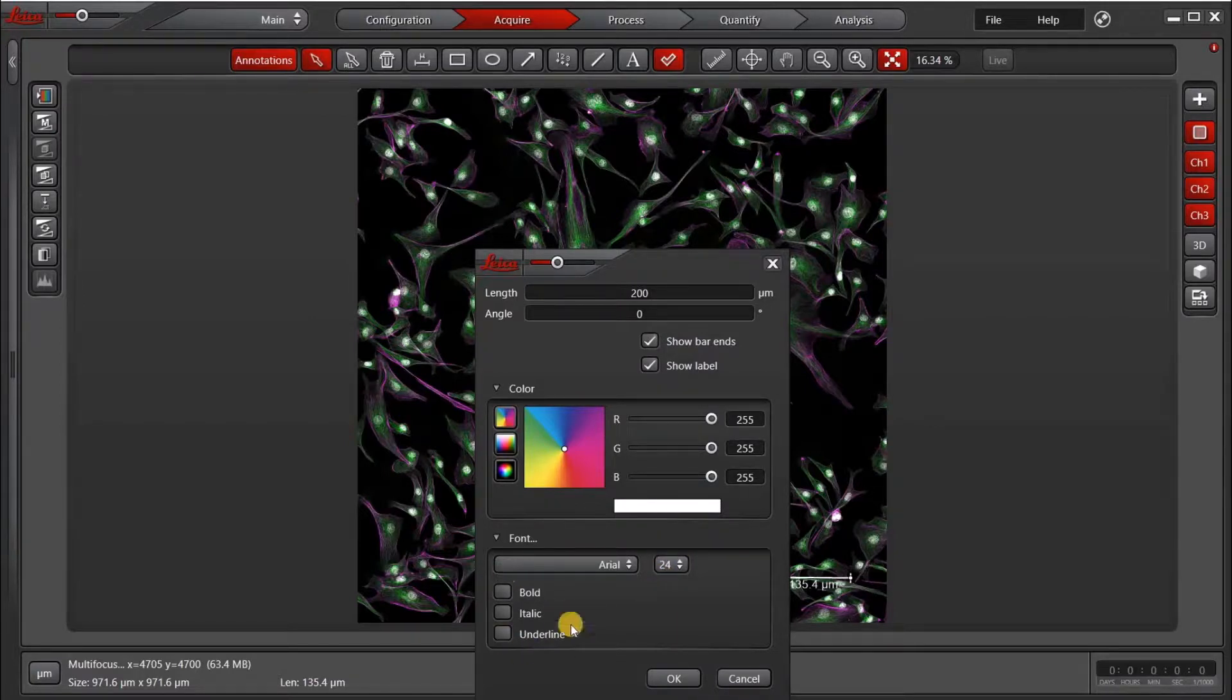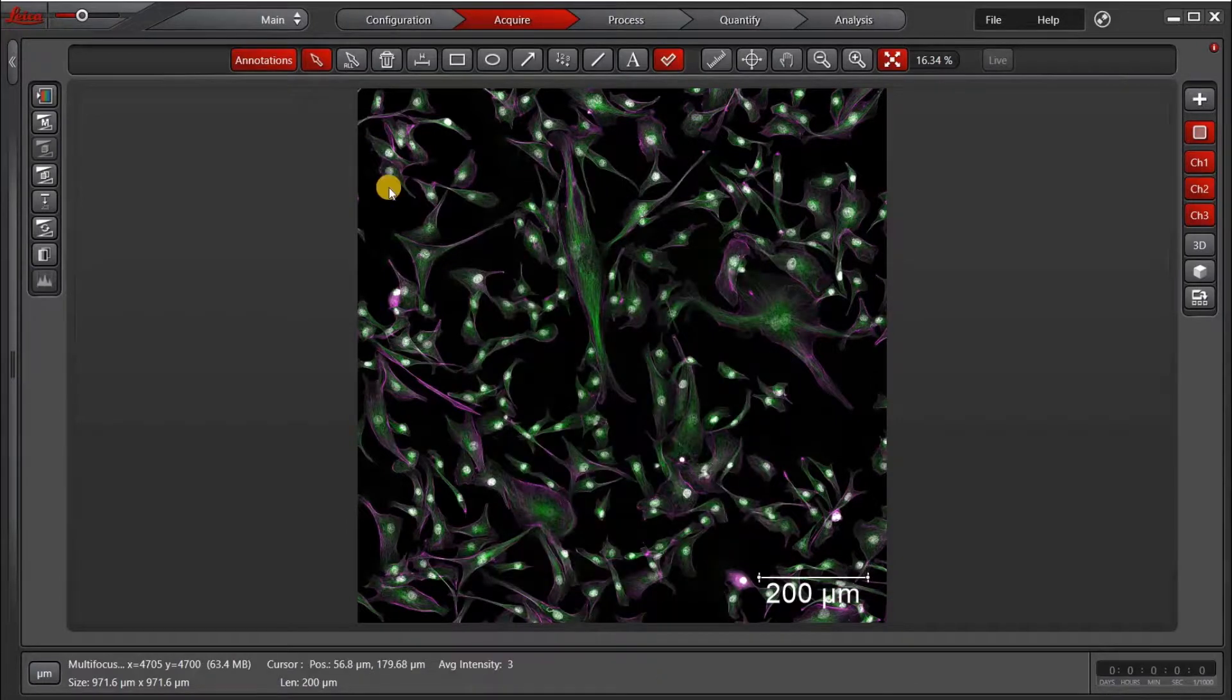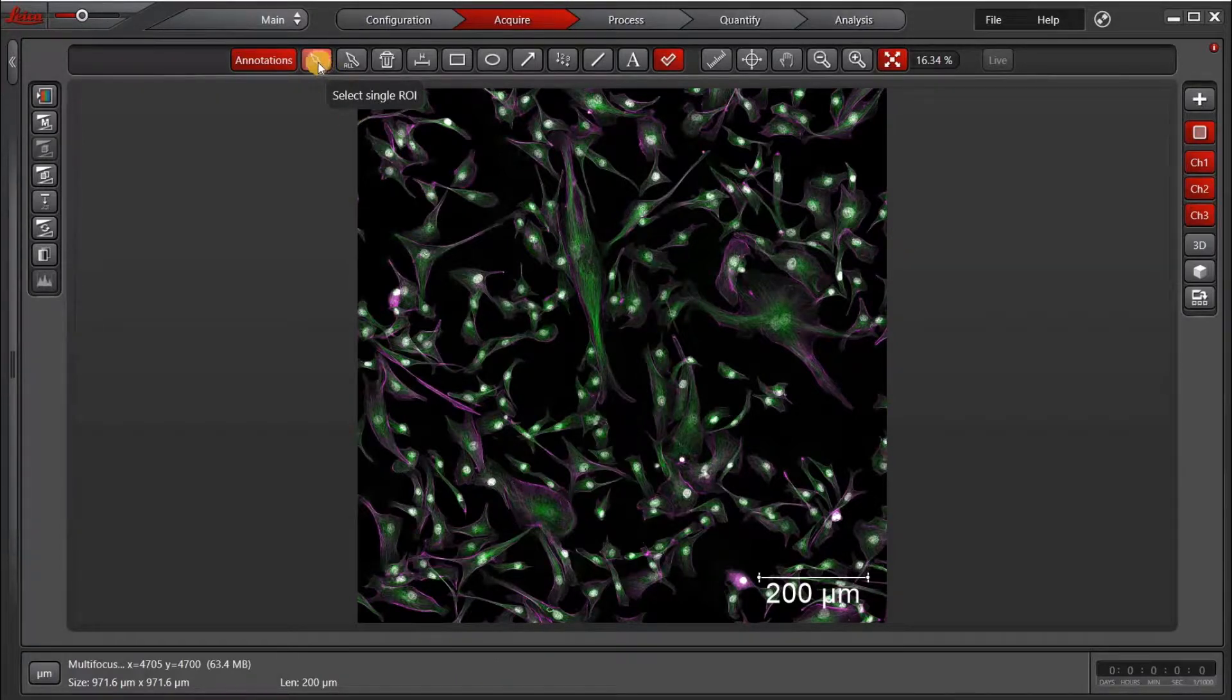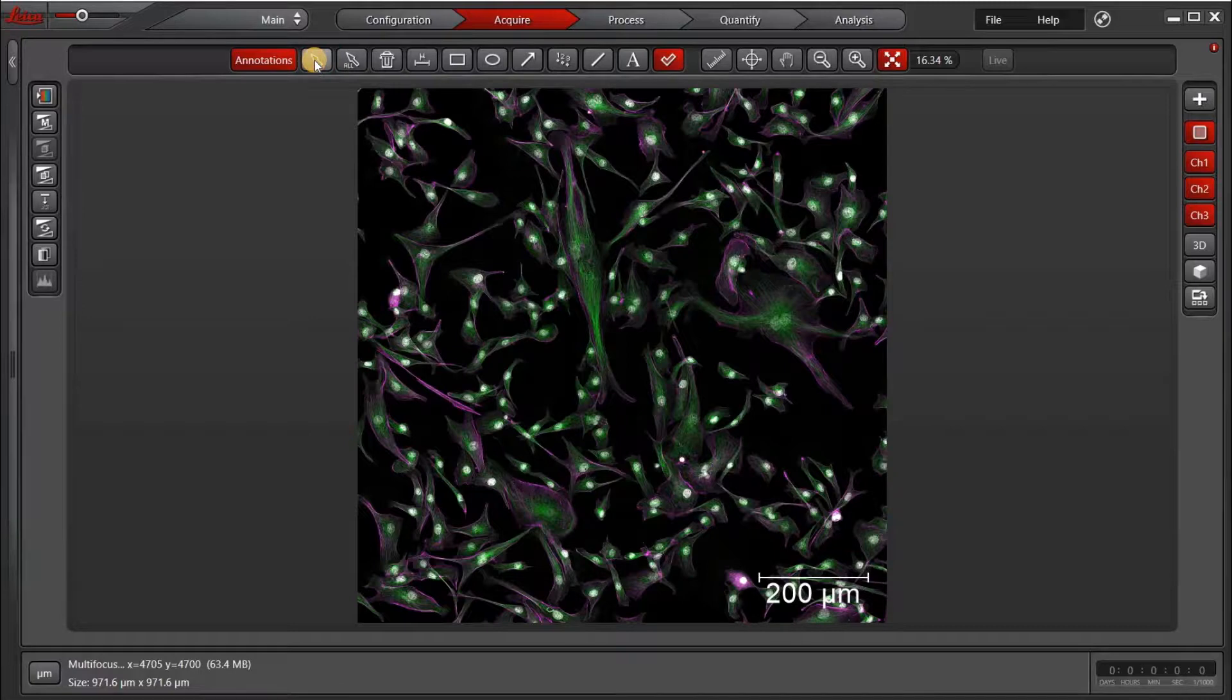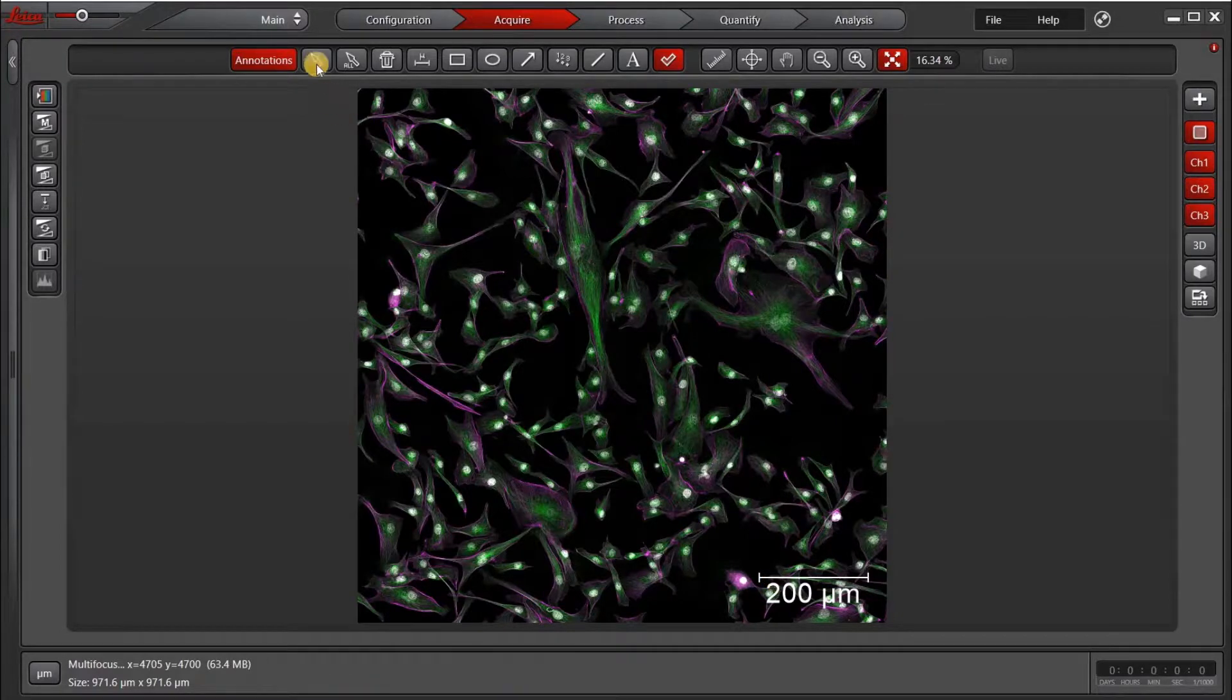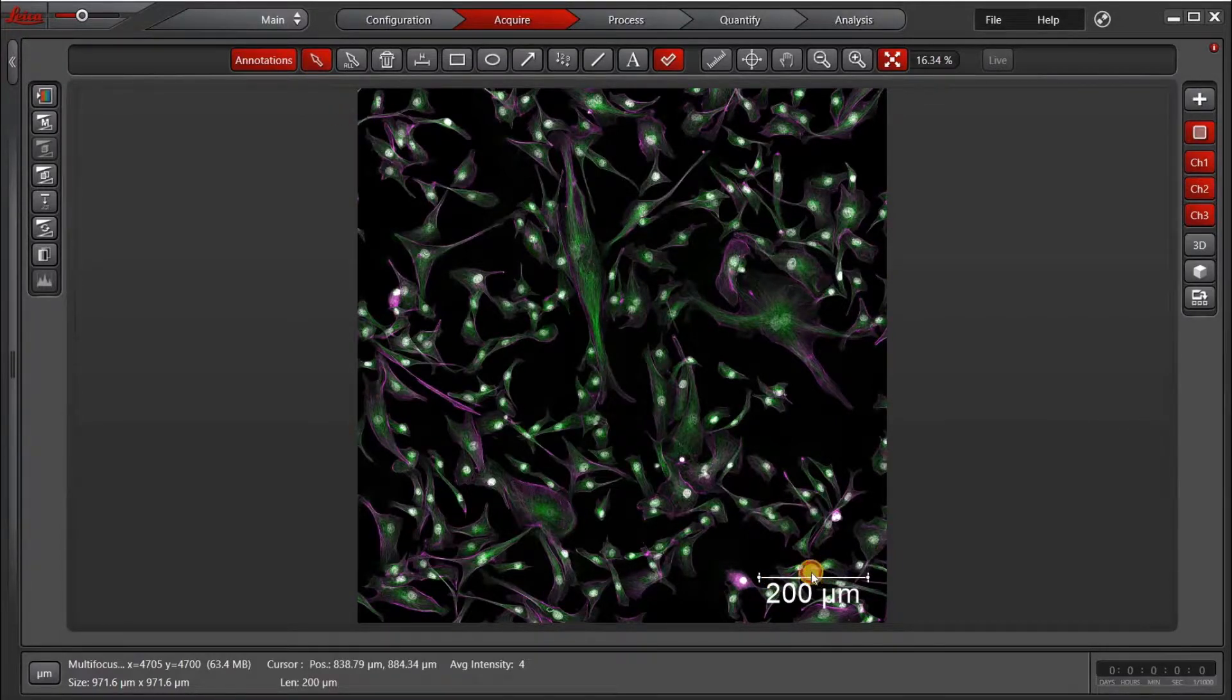And you can also add bold, italic, or underline. The most important thing when you're done with that scale bar before you export is to select this icon again, the Select Single ROI, so that the little dots disappear so it's no longer editable. If you want to move it now, you can just go back and select it and move it.